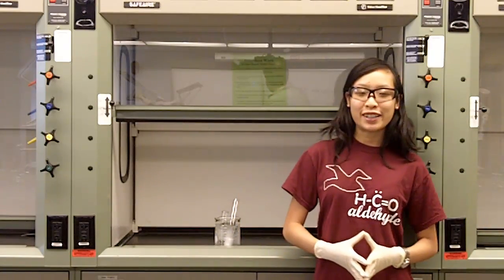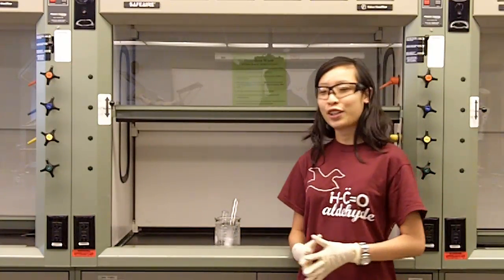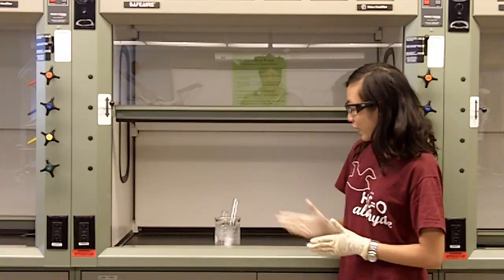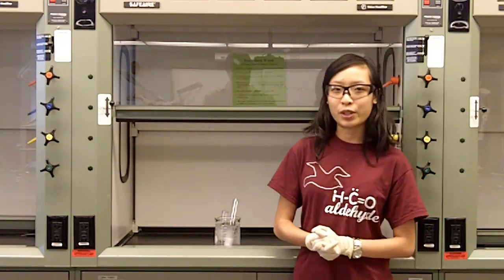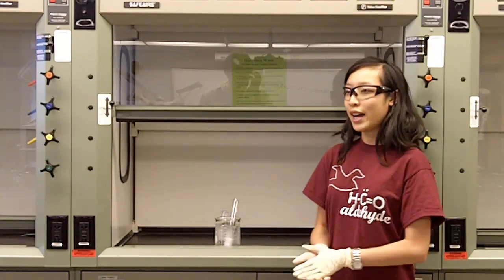Hi, my name is Kara Chan and I'm a student of NKU. Here we have some glacial acetic acid and we're going to tell you why I call it glacial.